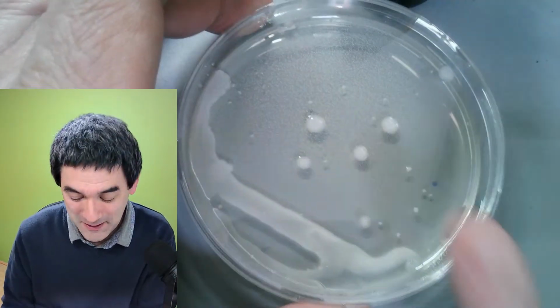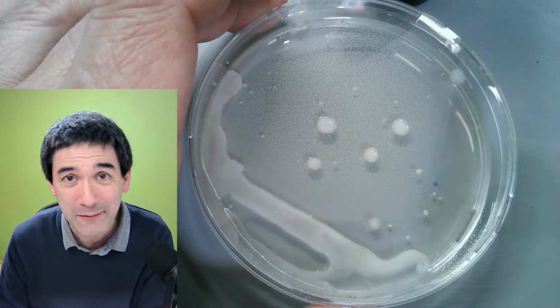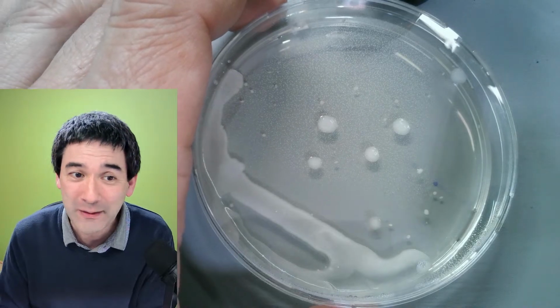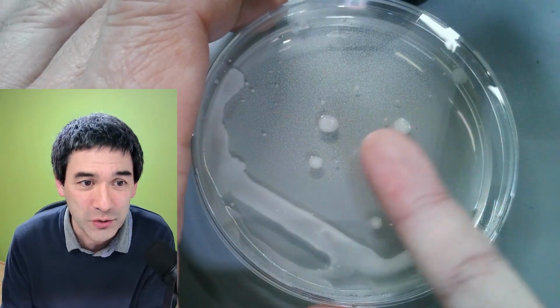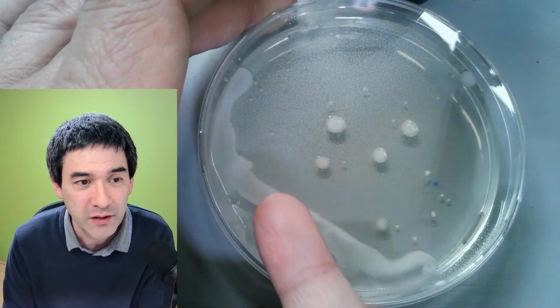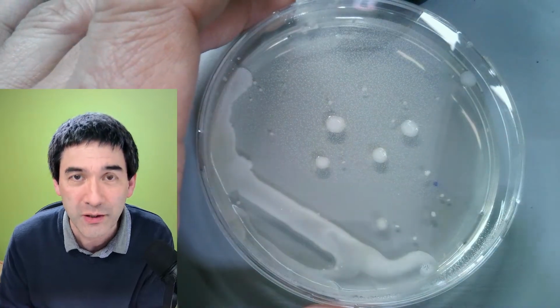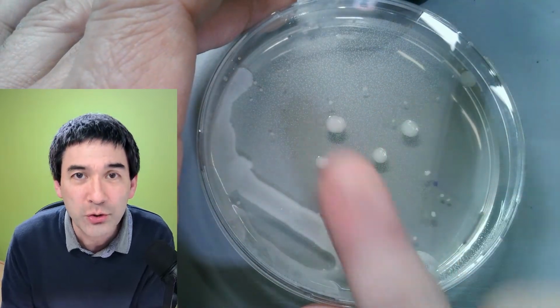What do you see here? You see here, I made the growth medium. I did not have an autoclave. I just boiled it over the plate. It wasn't enough. So what you've got here, those dots that you see here, these are bacterial colonies. And the thing that you see over here, that is because I had this condensed water running over it and distributing the bacteria. These colonies should not be there.